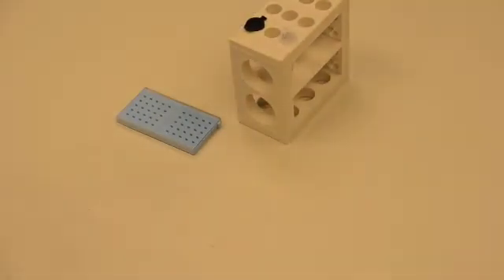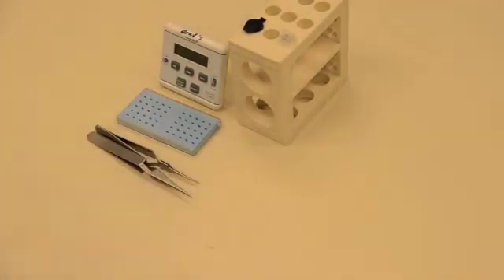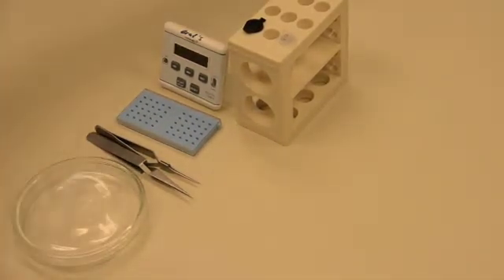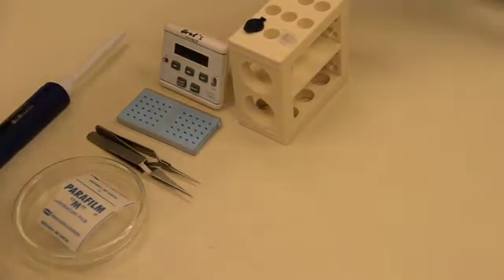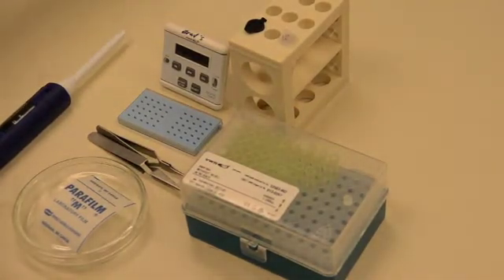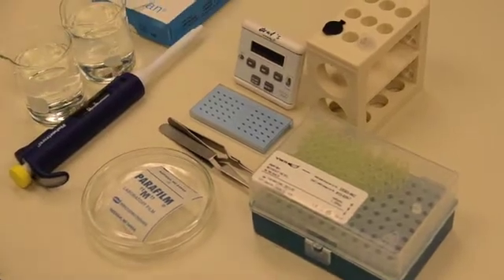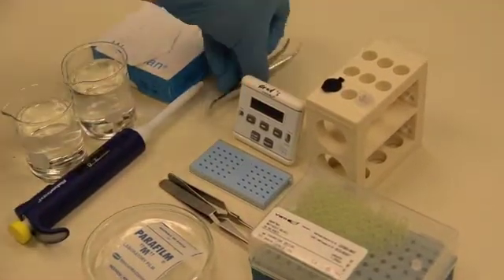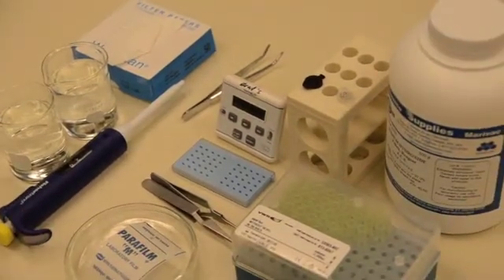To do staining, you will need grids with ultra-thin sections, stain, a timer, grid forceps, a petri dish, parafilm, a micropipette with pipette tips, two beakers of distilled water, hardened Whatman filter paper cut into small wedges, large forceps, sodium hydroxide pellets, and a cover to keep the grids dark.